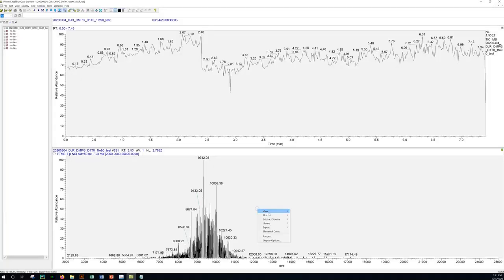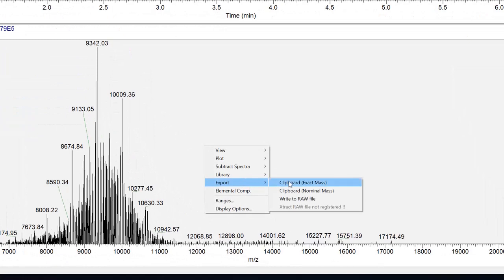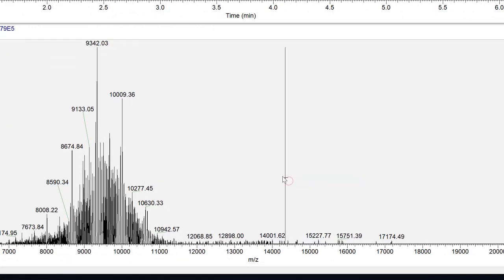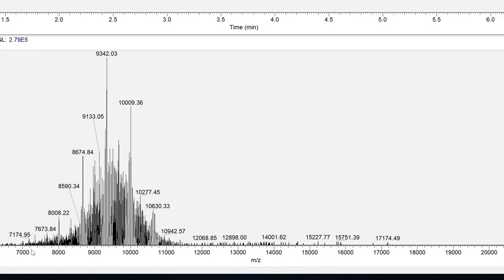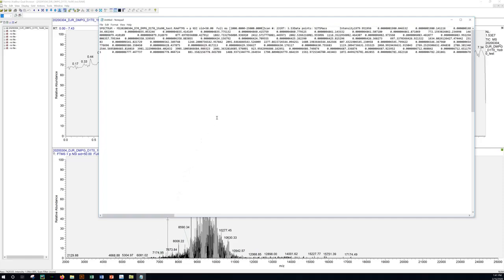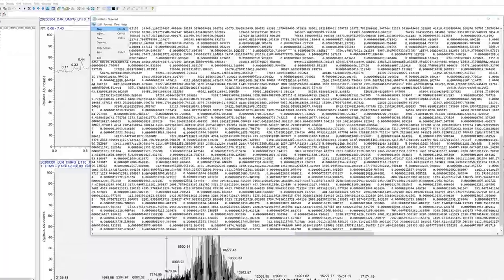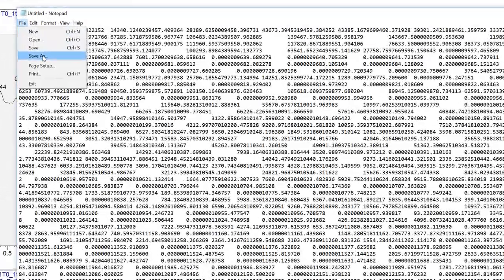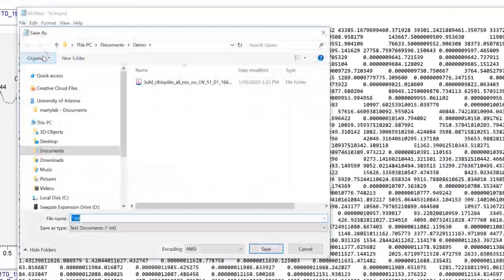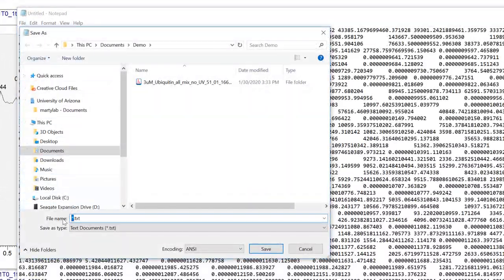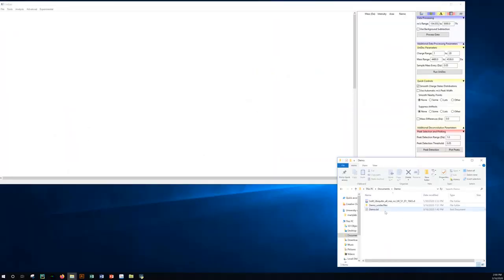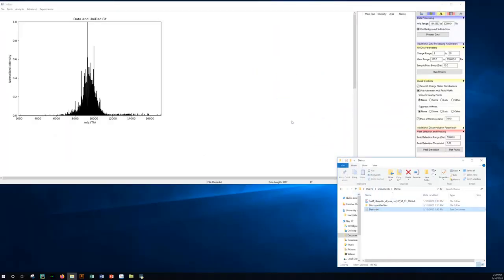You may also paste the data as a text file. In the same manner as before, copy your data to the clipboard and then paste into a text program such as Notepad and save. You can now drag and drop this file into Unidec.